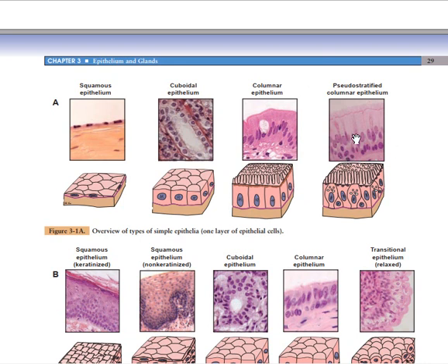You have a tendency to say that this is another cell layer up here, as you can see. So this is why you can see that it is stratified, but they are not actually stratified, because if you see the lowermost part of this cell and the uppermost part of this cell, all the cytoplasm is connected with only one cell, so it's not multiple cells that have those cytoplasm. Are you seeing? So that is why it is said to be pseudostratified.